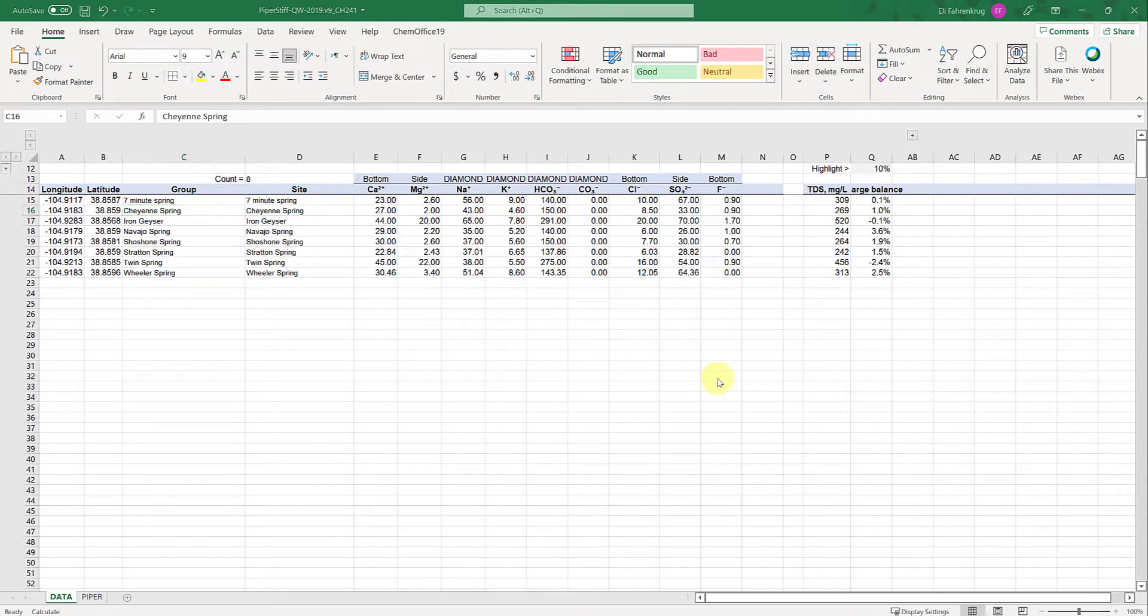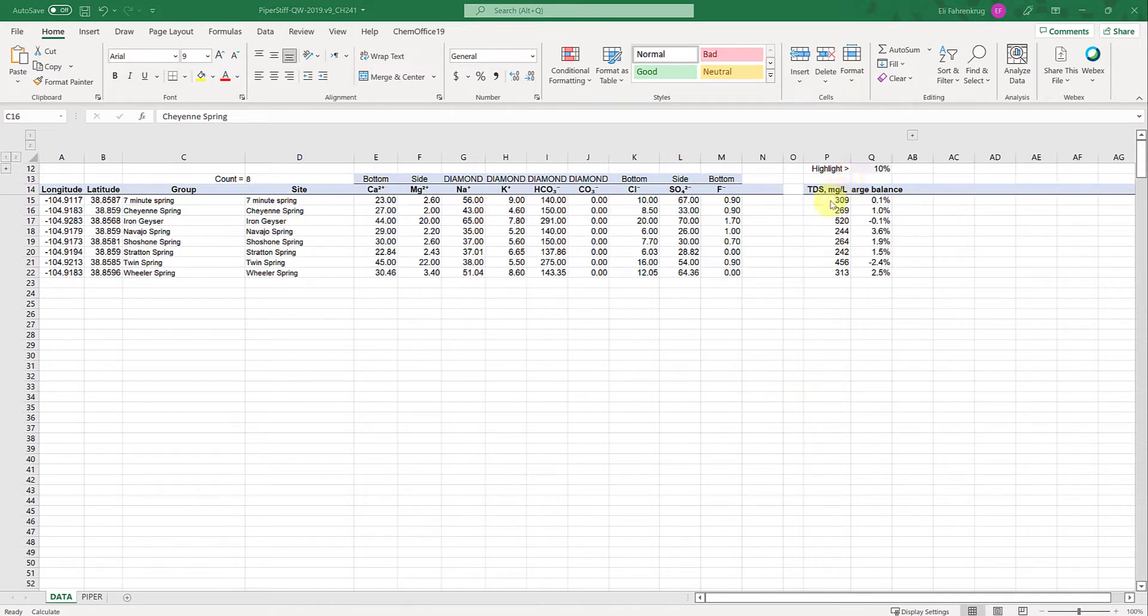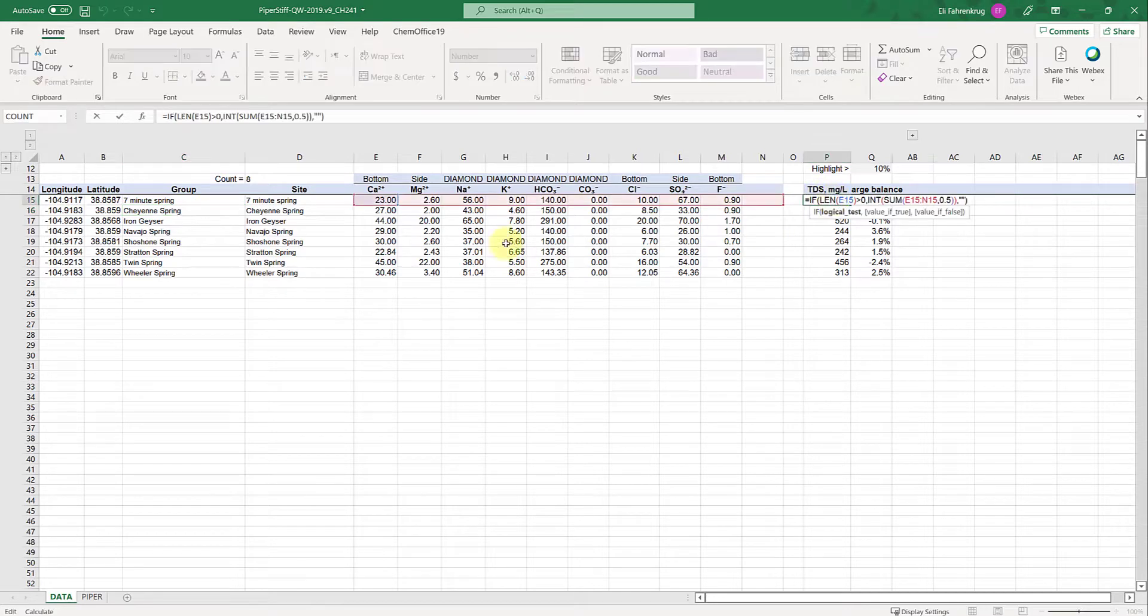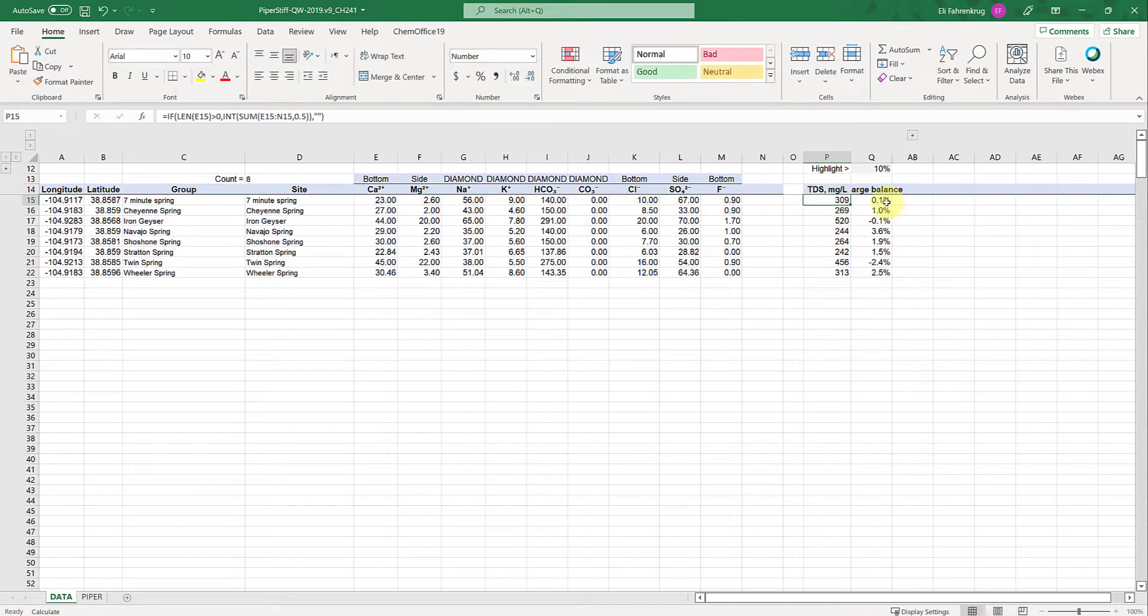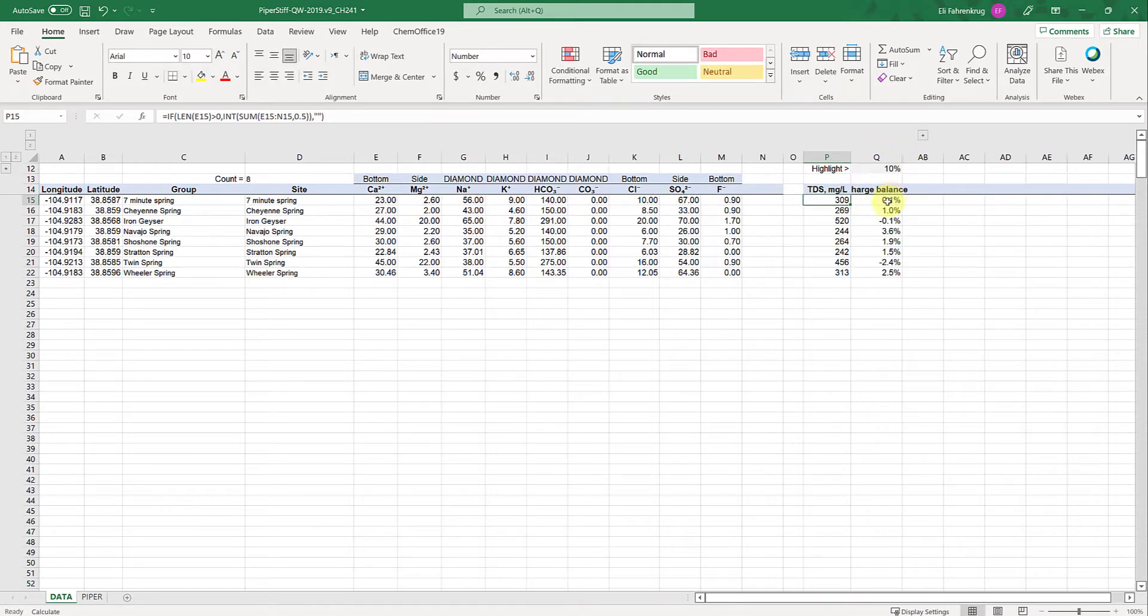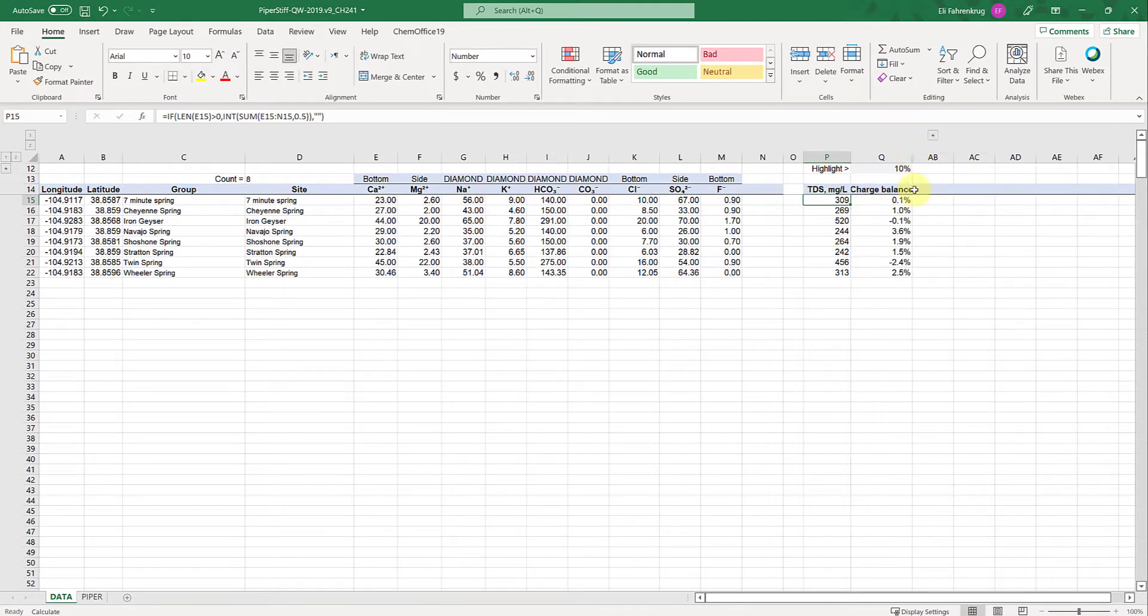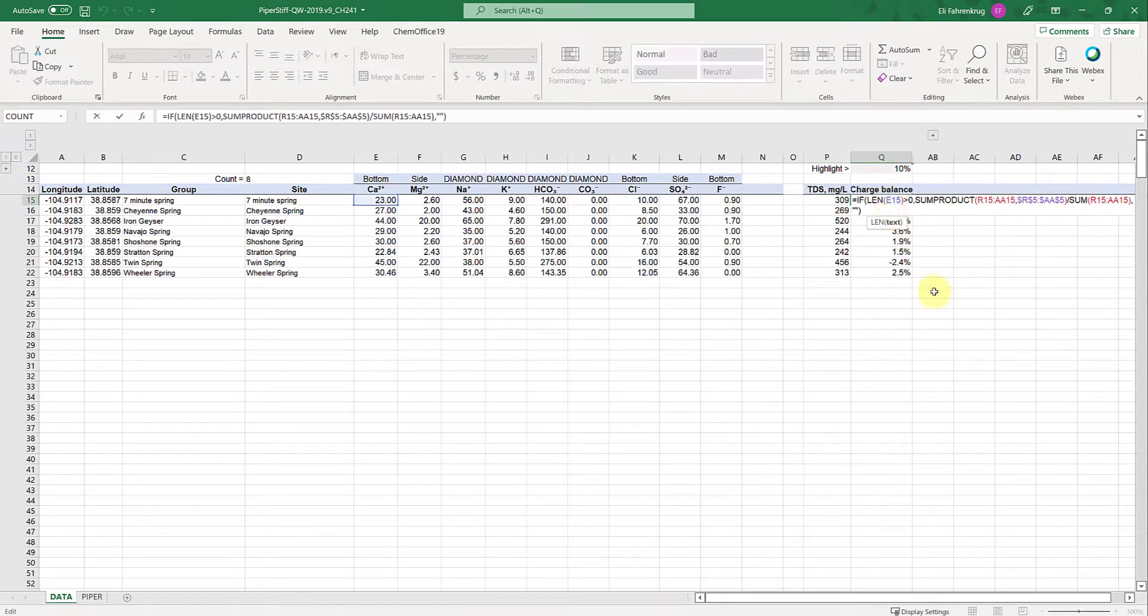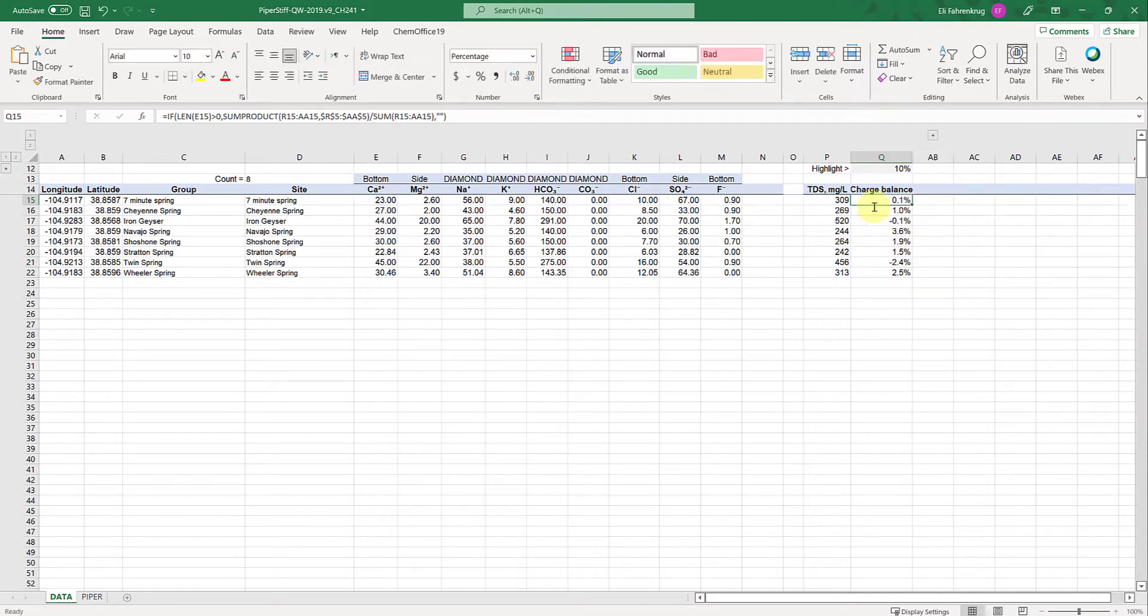What's nice about this interface is you have an automatic calculation for the total dissolved solids in milligrams per liter (TDS) as a function of all these inputs. You also have the charge balance, which can be computed. I have another video showing how to do charge balance in Excel manually and using visual minteq.